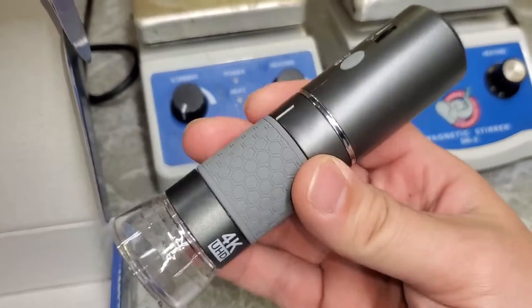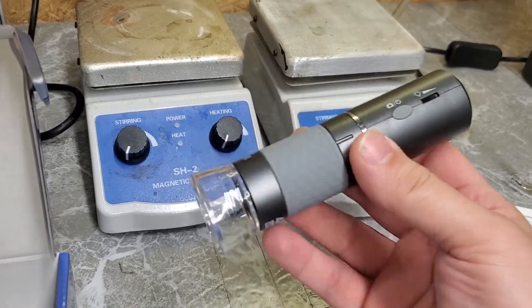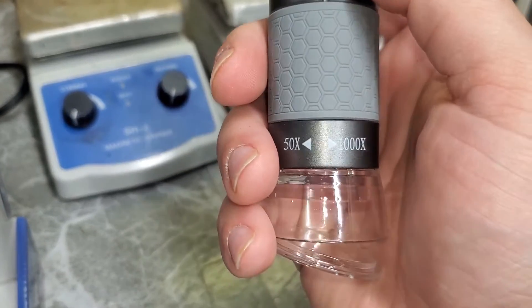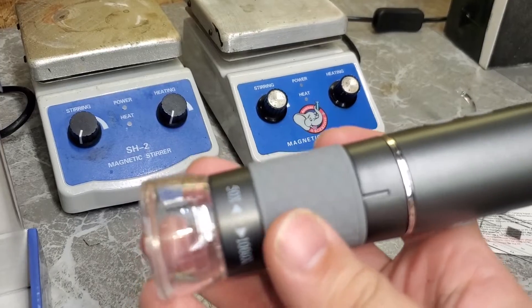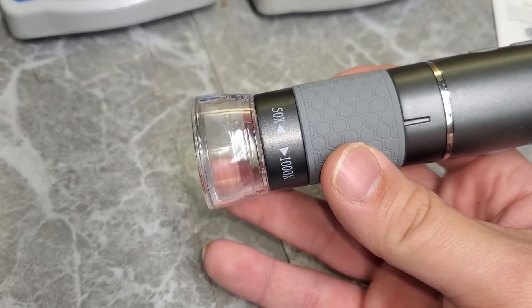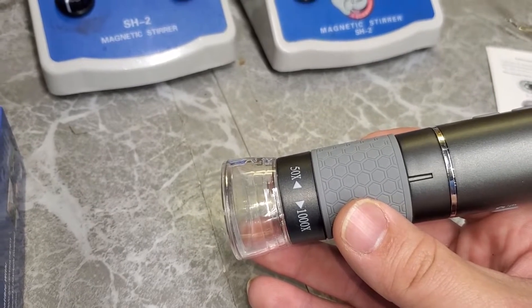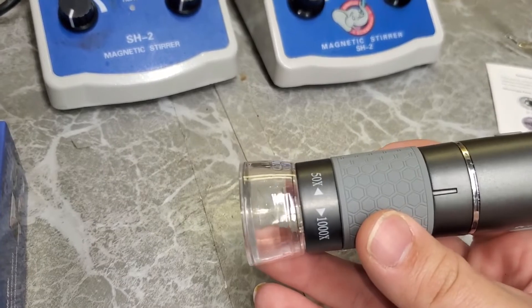Now the microscope itself — the bottom has a nice lens cover to keep dust off. It weighs approximately 86 grams and seems fairly well built. It says 50x to 1000x magnification, which is optimistic. You've got to have realistic expectations here: this is not a lab microscope — you're not going to be looking at sperm cells or individual human skin cells with this. This is for magnifying really small things, but not microscopic things.